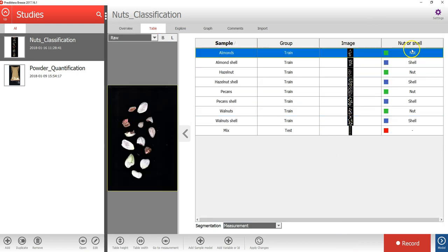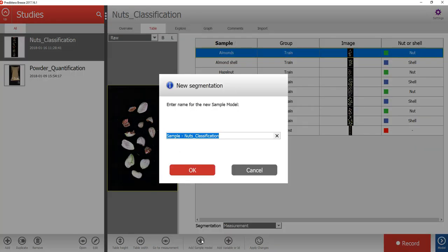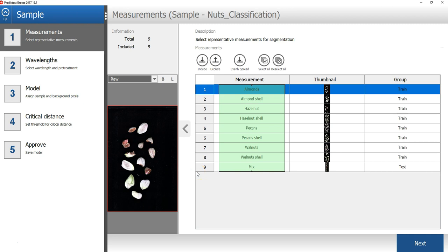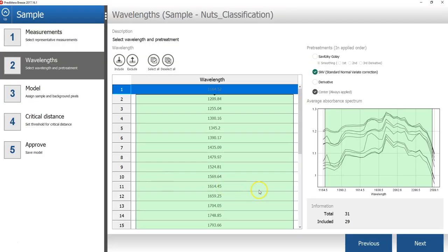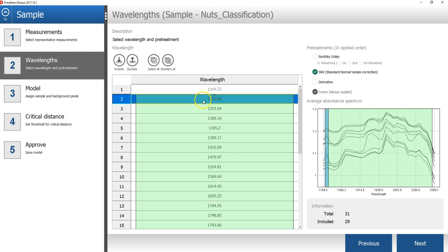The next step is to create a sample model to remove the background pixels and to automatically identify the objects — the nut or shell samples — in these images. To do that, I will press the Add sample model button underneath the table. In the first step of the sample model wizard, you can select the images you will use in the model; by default all measurements are included. In the next step, you can select spectral bands or wavelengths to use in the model; by default all wavelengths are included except the first and last band. So I will press next here.